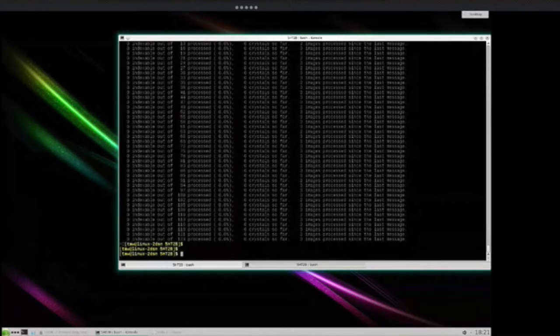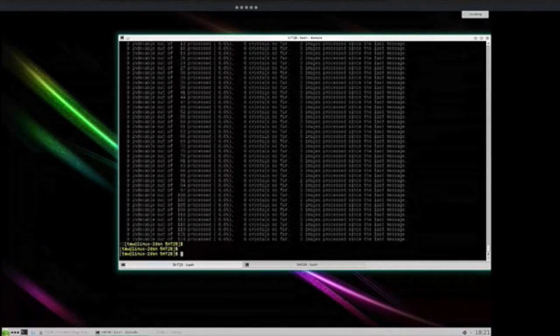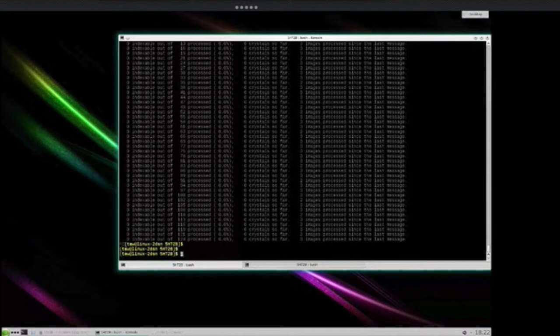The HDF5 files that we're processing here actually contain peak locations as well. That's because the prior processing steps for these patterns needed those peak locations, in this case to find the crystal hits amongst a much larger number of non-hits, where the X-ray pulse just happened not to hit any crystal. It turns out that detecting those Bragg peaks is a good way of sorting the hits from the non-hits. And then later on, why not reuse those peak locations for the indexing and integration steps?